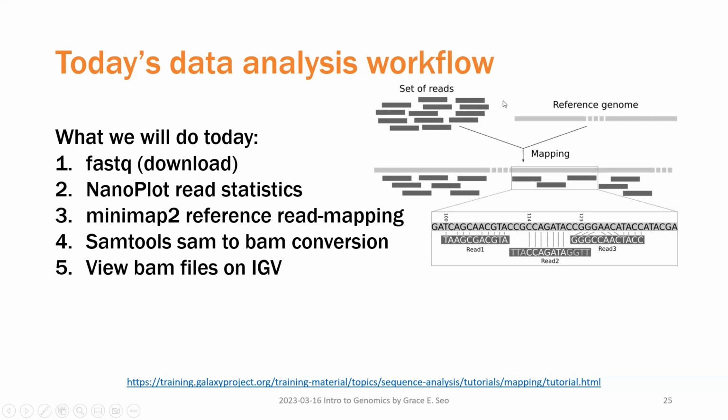So here's just an idea of reference mapping. So we get a reference fasta genome, and then we map our reads against the reference to get the information and eventually generate a consensus of the genome that we've sequenced. And this can be used to identify the virus, or you can check which type of mutations are present that was not present in the previous few months ago, or maybe many years ago.